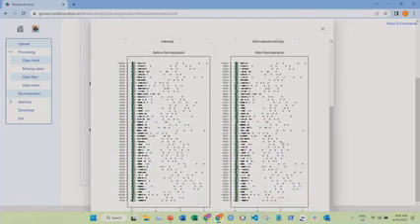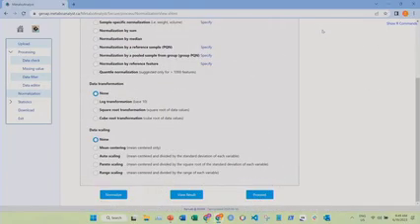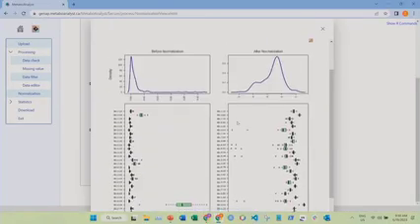Whenever we see this kind of pattern, where all of them are concentrated on the left side and then we have some way far on the right side, that usually means it's a good candidate for log transformation, which is almost always, unless your data was already log transformed. That's why we check, because if we log transform it twice, that is kind of nonsense. So I'll just log transform it and then we can look at it again.